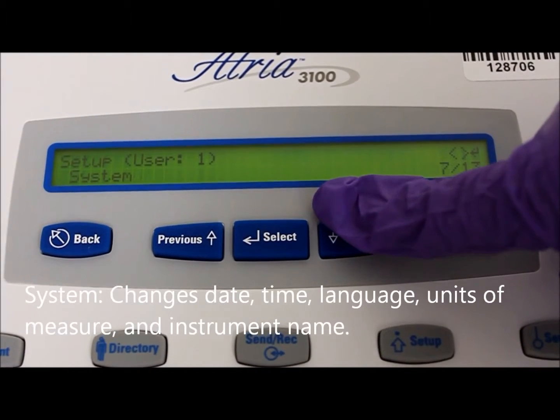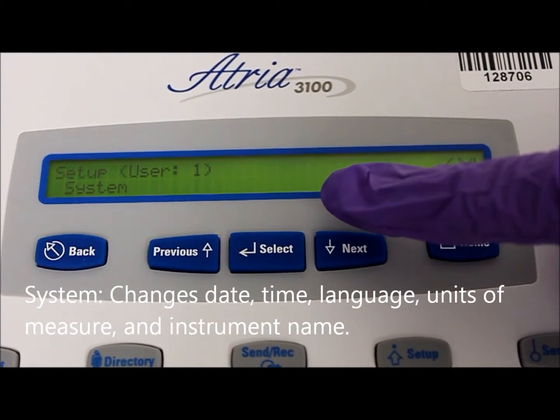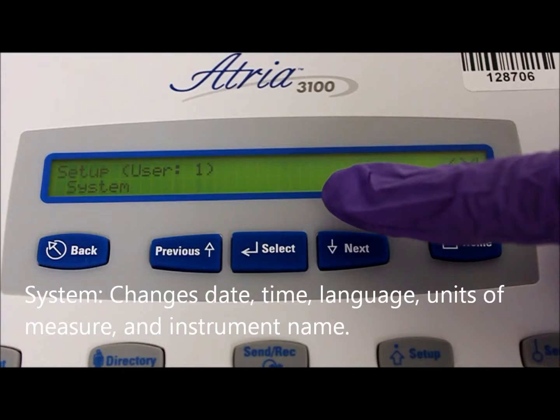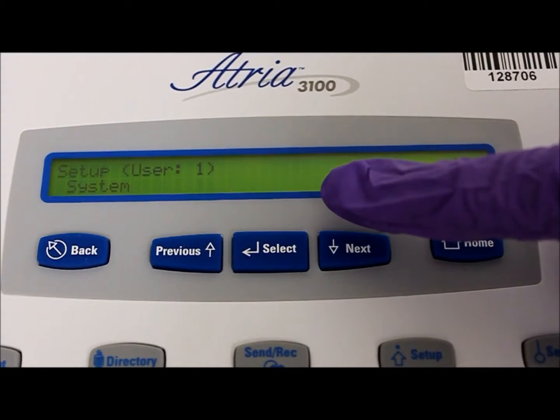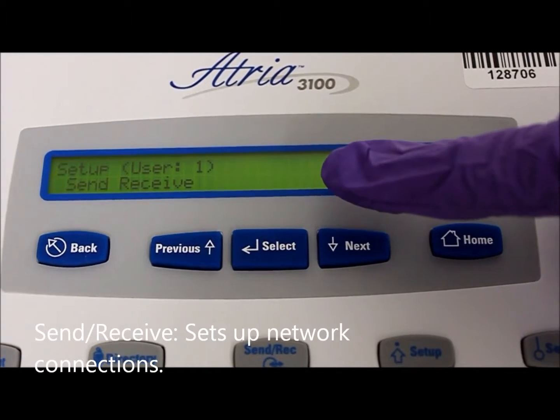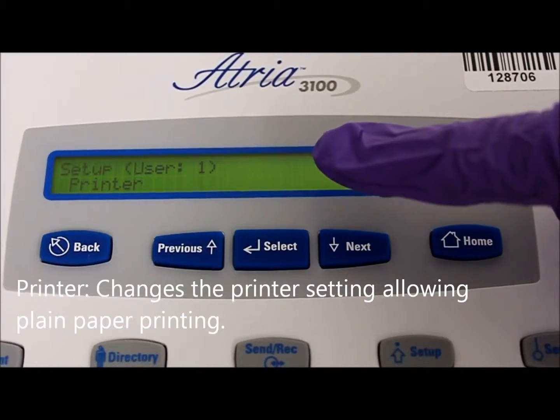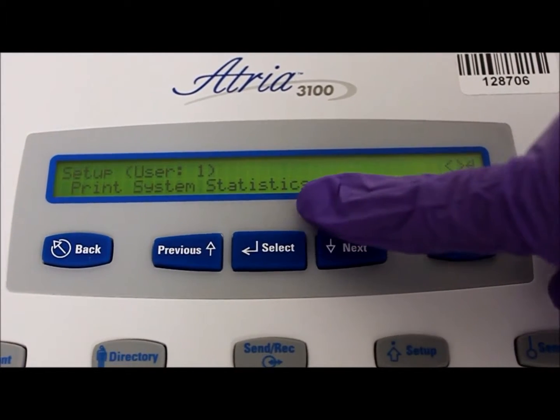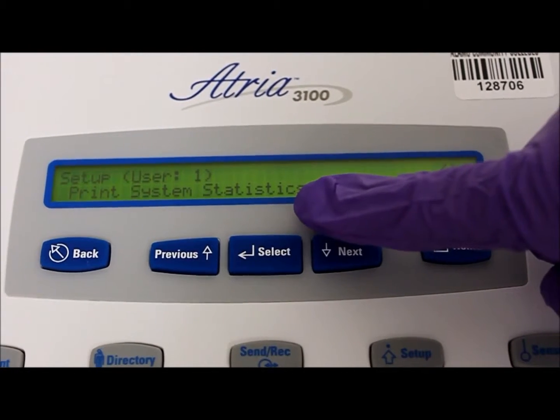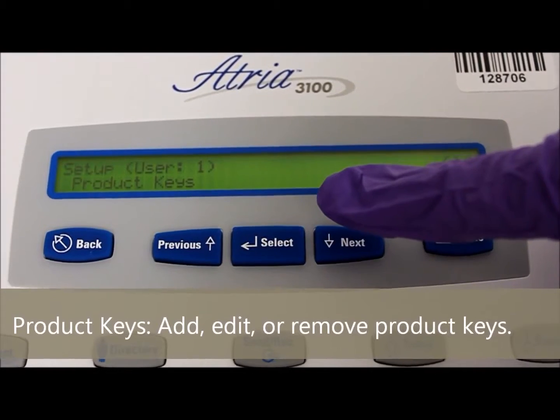System: this lets you switch between users 1 and 2, as well as change the date format, date, time, language, height units, weight units, instrument name. Send and receive: this option lets you set up network connections. Printer: this lets you change plain paper printing options. Print system statistics. Product key allows you to add, edit, or remove product keys.